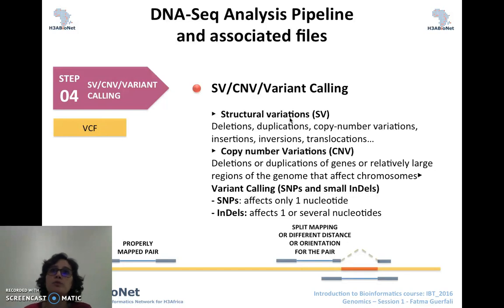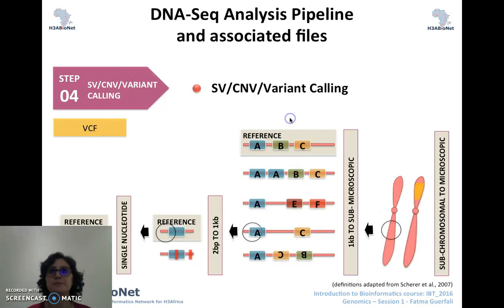If you remember, we talked about this as an advantage of choosing paired end sequencing over single end sequencing. So you have a general overview here of these events that constitute the common variation events that we look for using NGS.